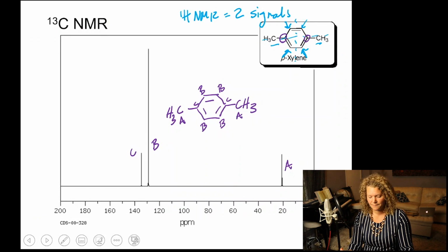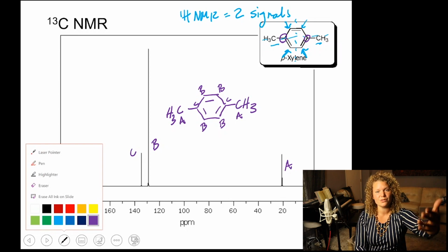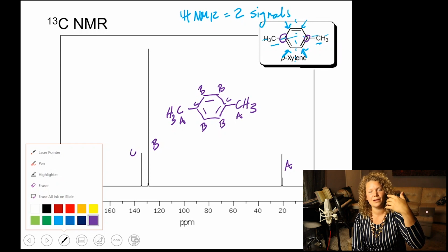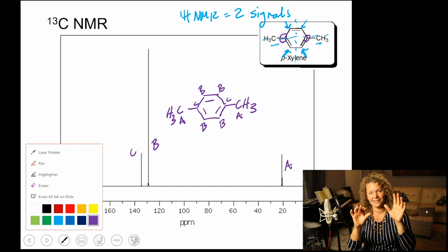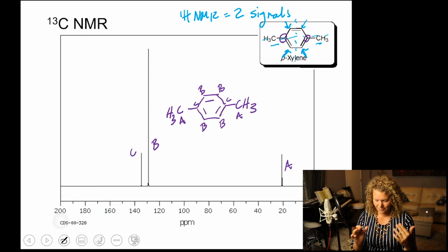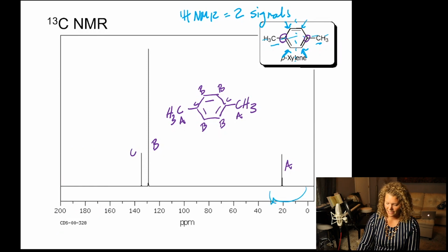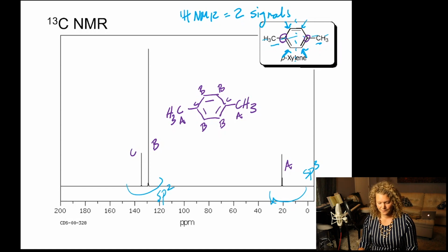And in this case, what I would be asking you on an exam is I would like for you to use a proton NMR, an IR, and a carbon NMR to help explain how you knew that paraxylene was the compound that all three spectra line up to be. And what you would do, typically what I like to ask here is that I would be having you label this as an sp3 carbon. And I would want you to know that these two are sp2 hybridized carbons.